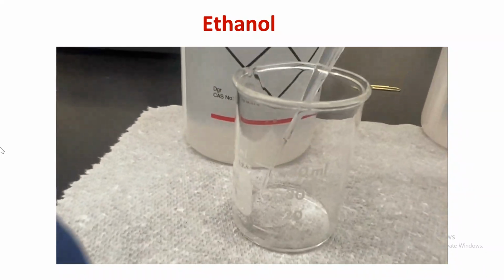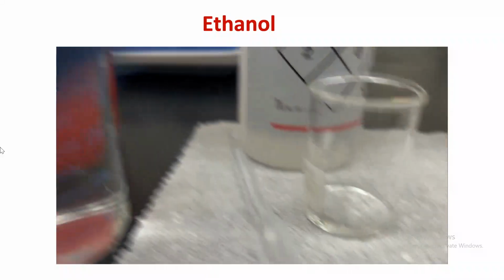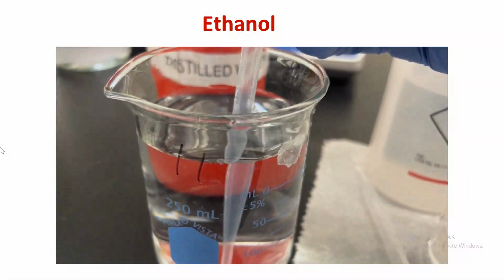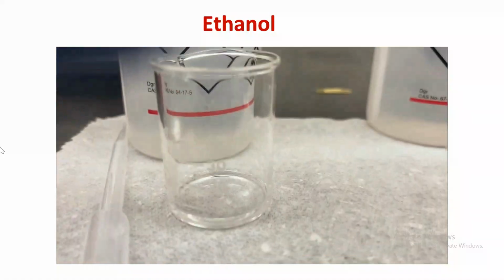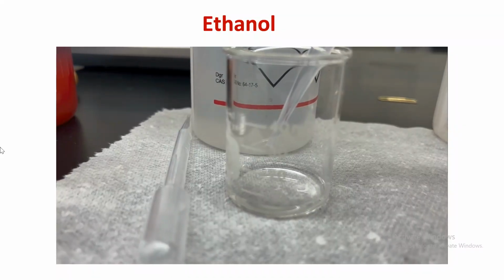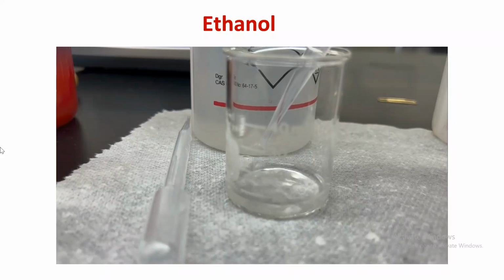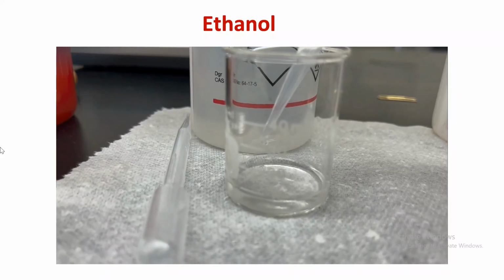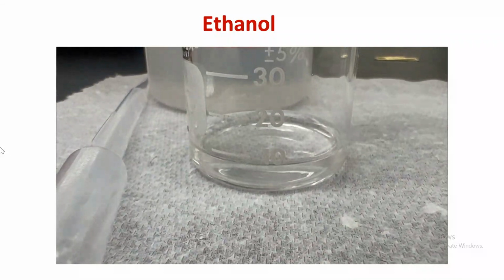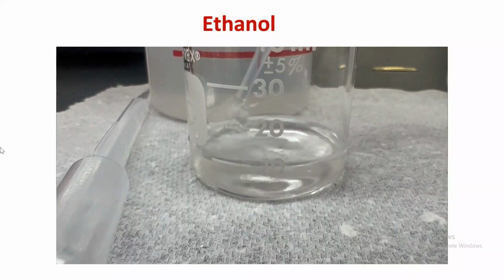So we will be using the pipette, adding some ethanol into the beaker. That equipment is called a beaker. We'll be taking some distilled water, which is pure water, and we'll be adding it. Now we want you to notice, do you see two layers or do you see one layer? As you can see, it is just one layer, homogeneous mixture.